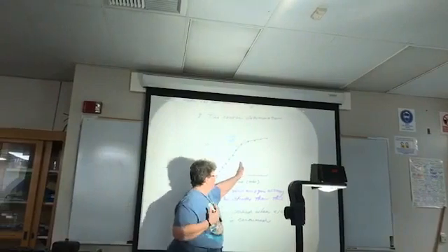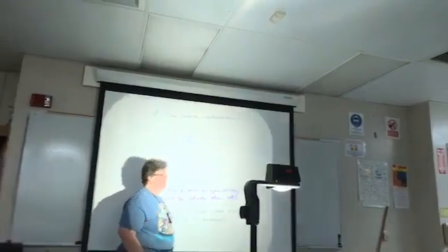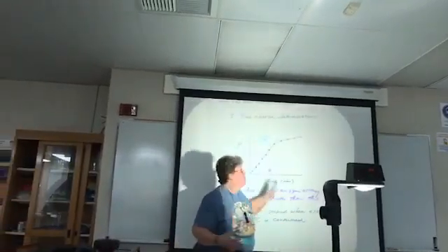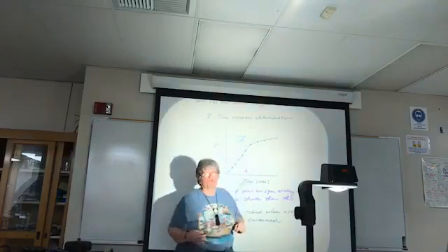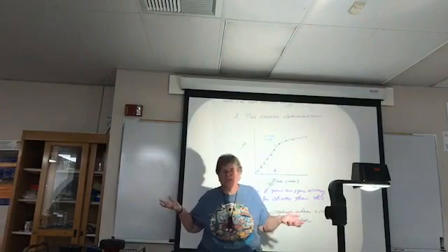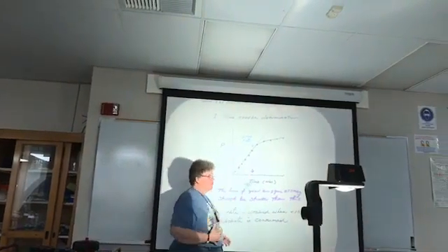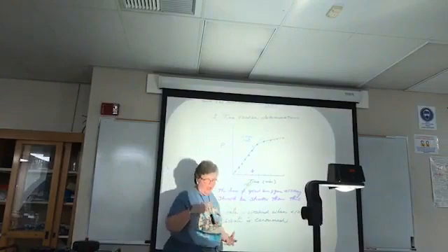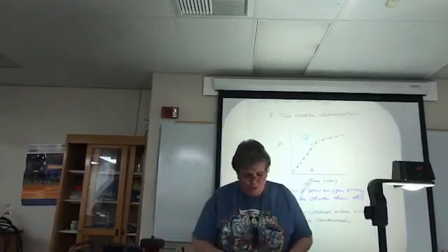So then you'd say, okay, here's the perfect time to use, so you'd want to make sure that your timeline is like this. If your initial reaction took place over 6 minutes, but you saw that it was only linear for the first 3 minutes, for example, then all the future reactions can simply be done in 3 minutes, because you started off by saying, we did it for 6 minutes, we saw that 3 minutes was enough, and now we're just going to do the rest for 3 minutes. So that's what you're actually going to be doing in part A of this experiment.